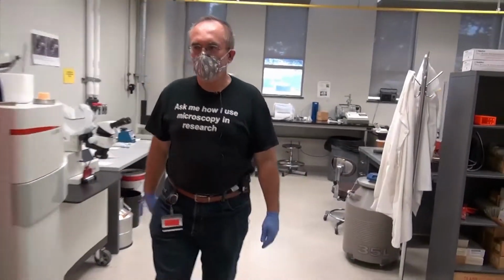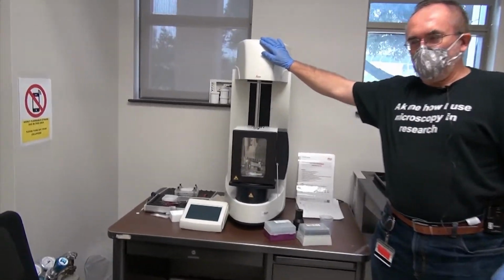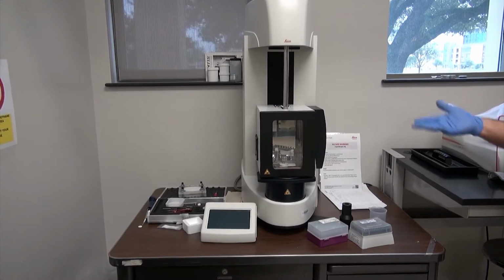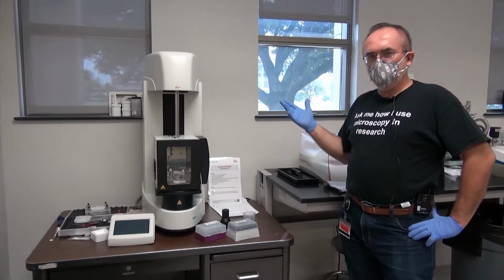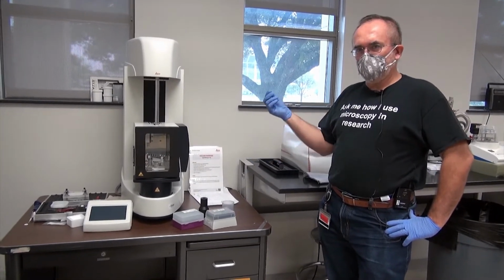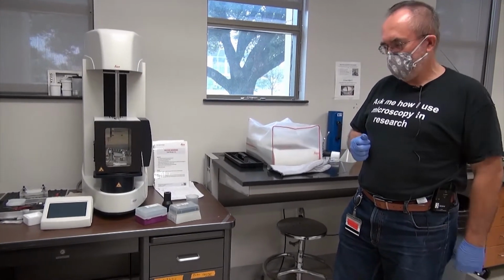So in this room, I would like to show you several of our sample preparation tools. This is a Leica GP2 cryo-plunging apparatus. This is to prepare relatively thin samples, like suspension of viruses, liposomes, protein complexes. And this instrument has computerized controlled blotting of the sample once it's applied on a special EM grid, and then it's plunged into liquid ethane so that it's vitrified without ice crystal formation. And it is then imaged on our cryo-TEM instrument that you will see in a moment.